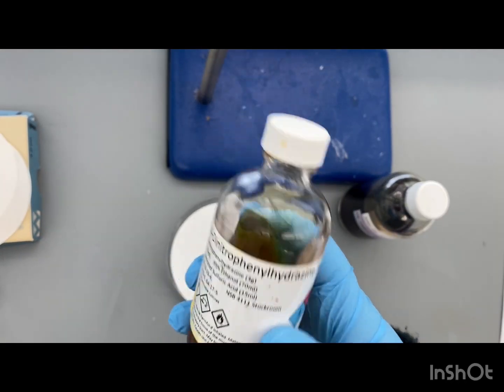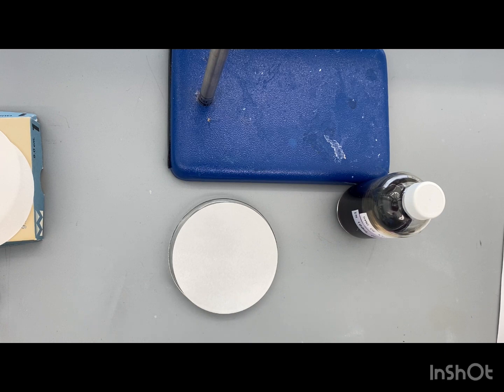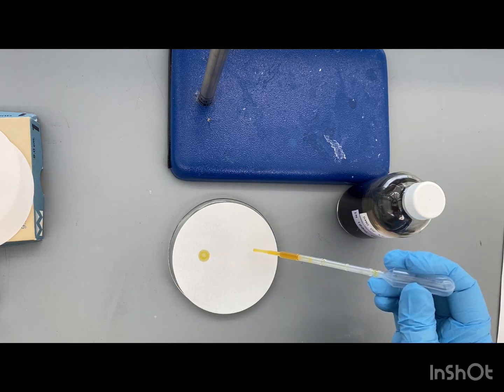Here we have the DNP test. So you're going to get your filter paper, put it on a watch glass. You're going to spot the paper twice, one for a control and one for the actual product.